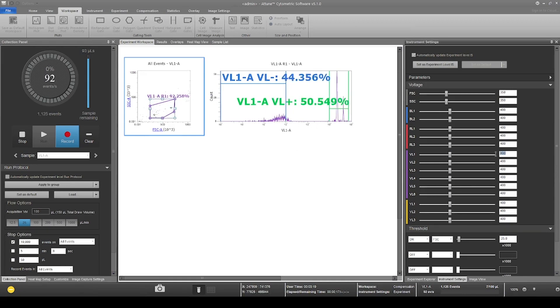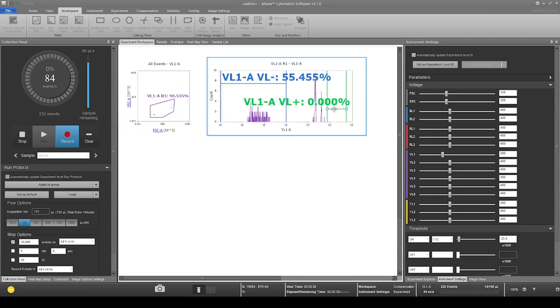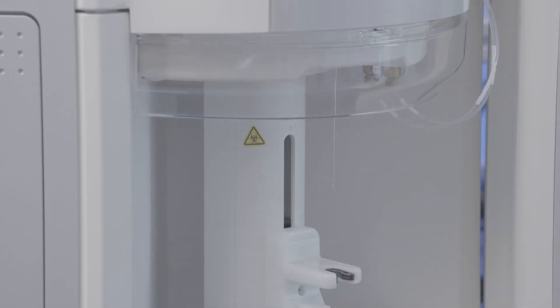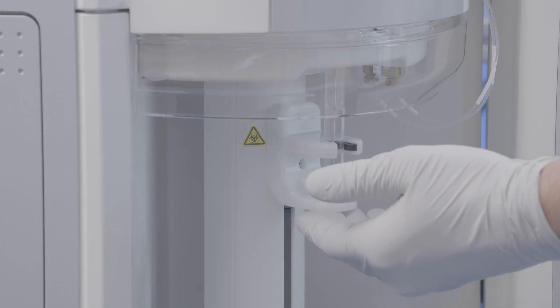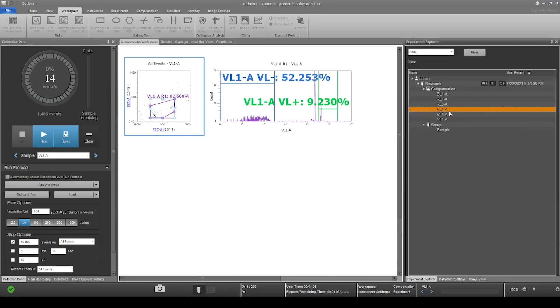You'll want to move the scatter gate to encompass the events. Adjust fluorescence gates for the channel of interest around the negative and positive peaks on the histogram plot. Press stop and prepare to load your next sample. The instrument will automatically perform a rinse and is ready for your next color sample. We will repeat the same steps for each color channel.